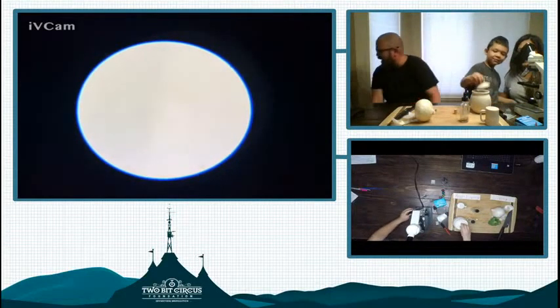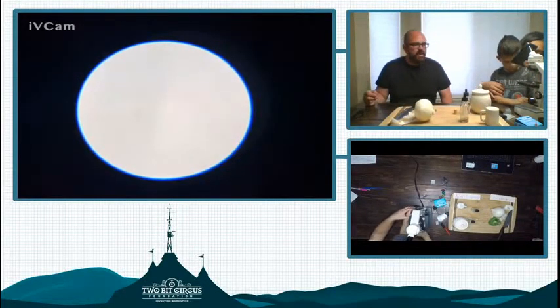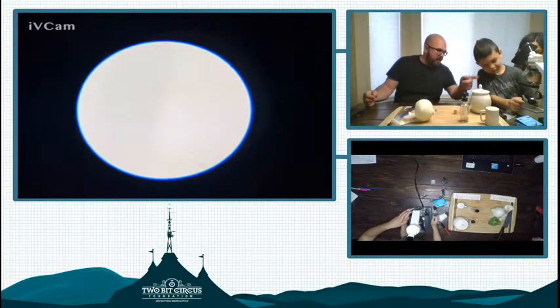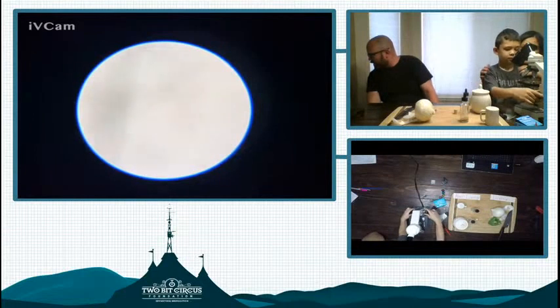Yes, Gonzalo. Some hair follicles would be pretty interesting to use as well. Maybe later, Robert, we could look at some hair follicles of yours too. You want to do that? This one, baby. The big one. The big knob is gonna help you. That is a great suggestion. We'll look at that hair as well. Keep going. Keep going until you see something.